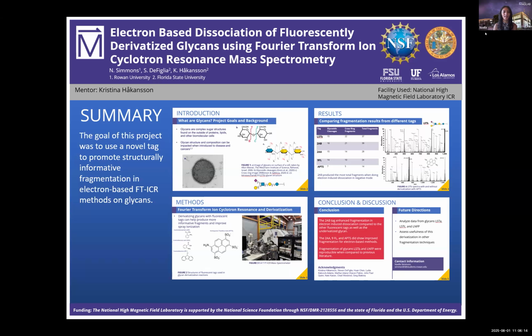My project was doing electron-based dissociation of fluorescently derivatized glycans using Fourier transform ion cyclotron resonance mass spectrometry. The goal of this project was to use a novel tag to promote structurally informative fragmentation in electron-based FTICR methods on glycans.